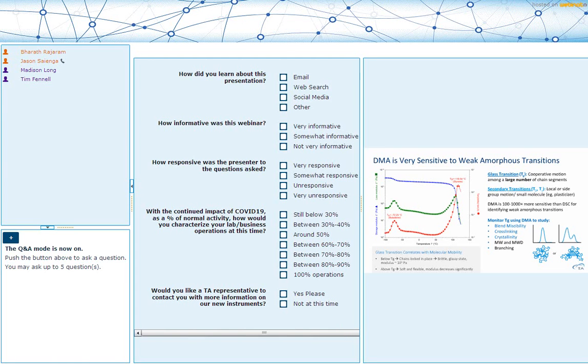From an engineering perspective, the onset point might be preferable because that is the temperature at which the modulus starts to drop off significantly, and you want to stay several degrees below that to make sure the sample does not lose its structural rigidity. The onset point calculation can be subjective. It depends on the limits that you have, and that's why we recommend using the tan delta, because the peak is more or less unambiguous.